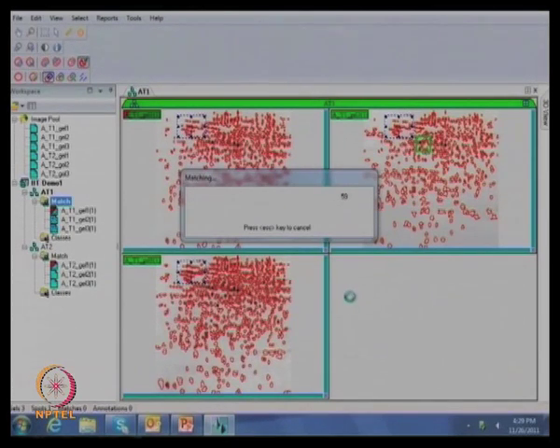Now we are matching only control gels, only one group. How is our reproducibility within one group? This is what we have to check initially.